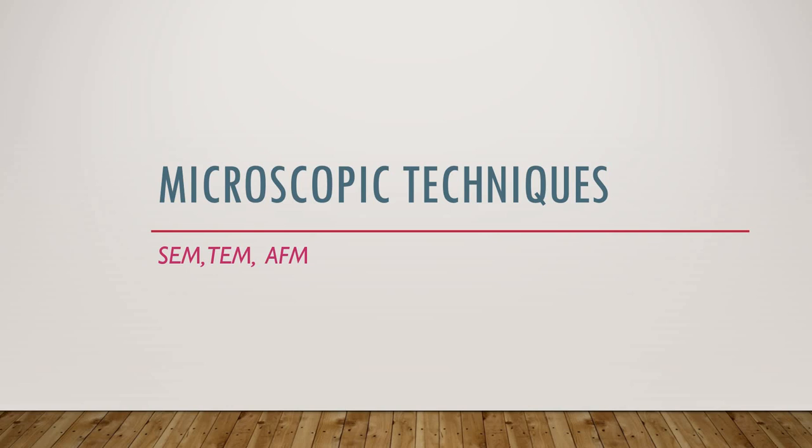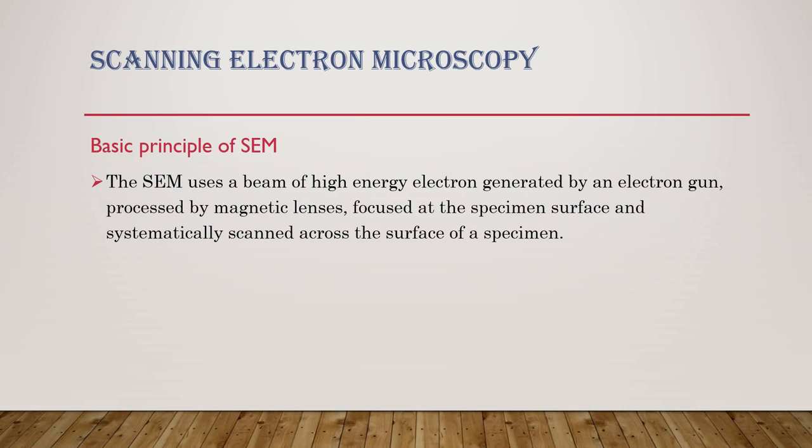In today's lecture, we are going to learn about the microscopic techniques, that is scanning electron microscopy, transmission electron microscopy and atomic force microscopy. So first of all, we will see the scanning electron microscopy, that is SEM.